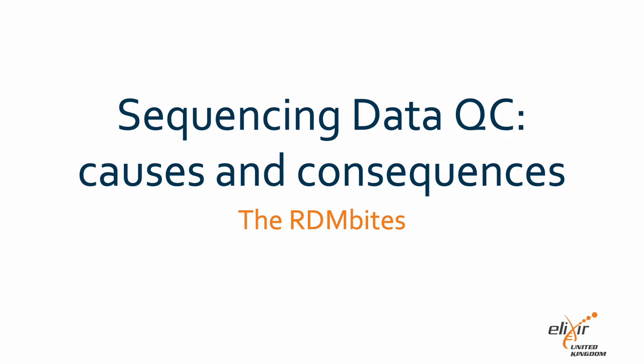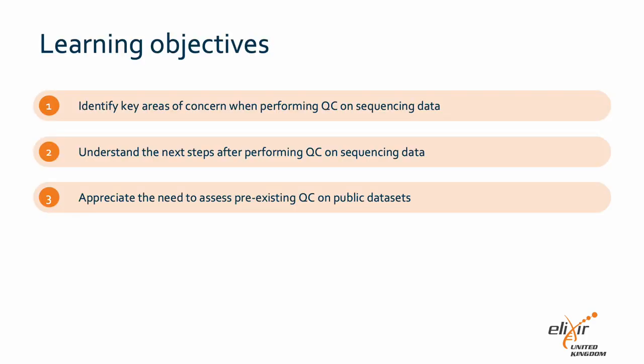Hi, my name is Andrew, and today I'm going to be talking about the importance of performing quality control in high-throughput sequencing data. In this RDMbite, you will learn about how poor quality sequencing reads may arise and how QC fits within the overall pipeline for analyzing sequencing data.